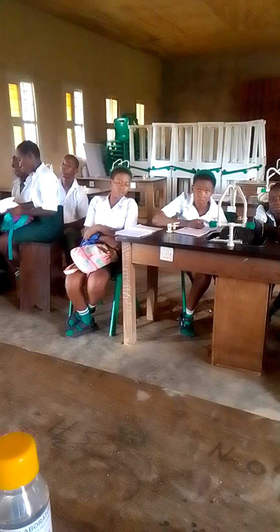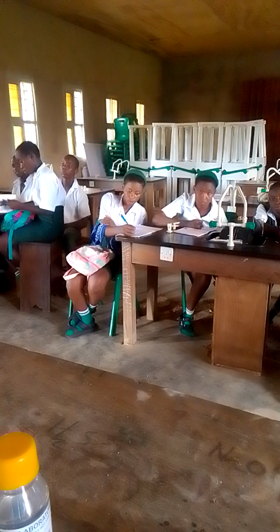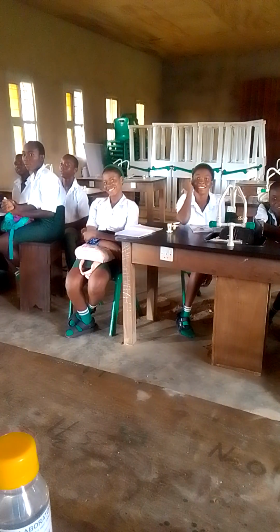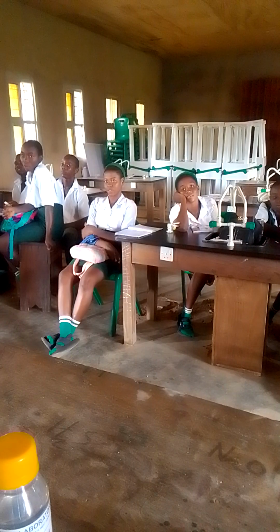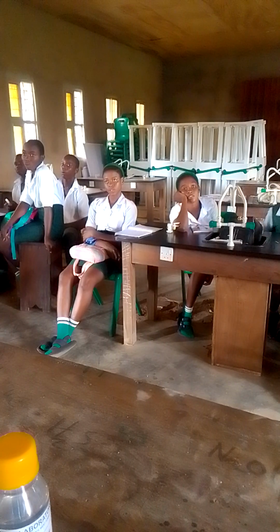So we are going to look at the two radicals, basic radicals and acidic radicals. That is what we are going to test. That is iron and sulphate. Iron is the basic radical, called cation. And the sulphate is the acidic radical, called anion. So that is what we're going to do.